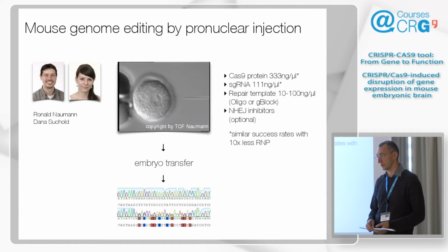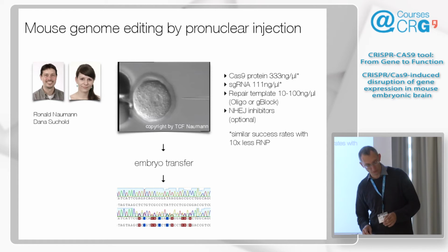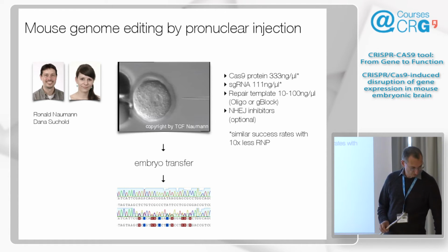Also, we have fluorescently labeled ones. We have Cas9 with mCherry, GFP, and other fluorophores. I don't remember all of them. We also have the dead version of this, so you could use it for imaging. But no, I was just curious because somebody used 1, 2, or 3. Well, it works with 2. I don't know if more is beneficial.